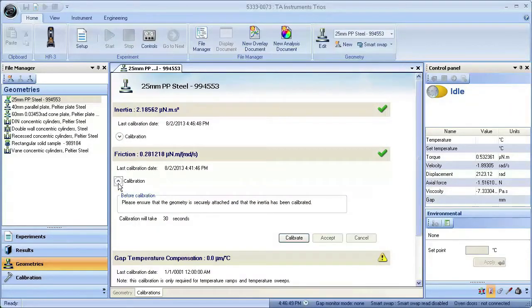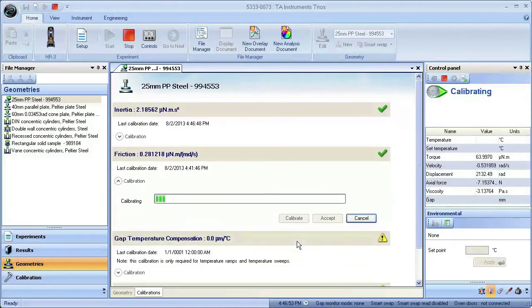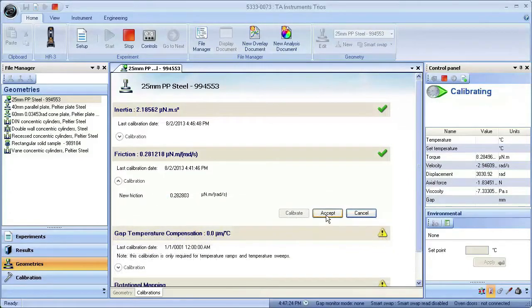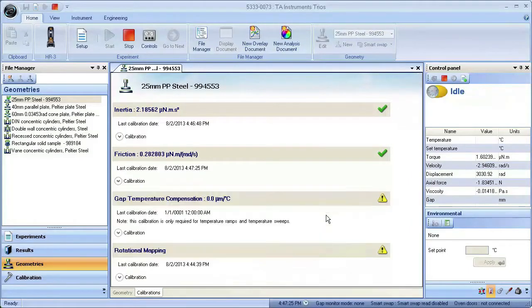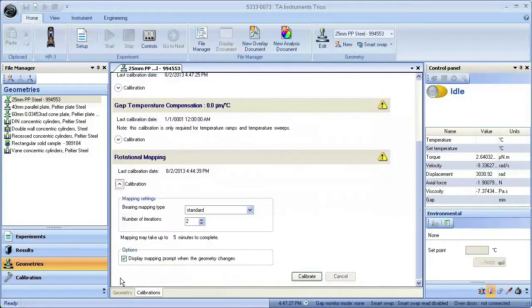Expand the friction calibration, press Calibrate. Accept the friction calibration values and move on to Rotational Mapping.